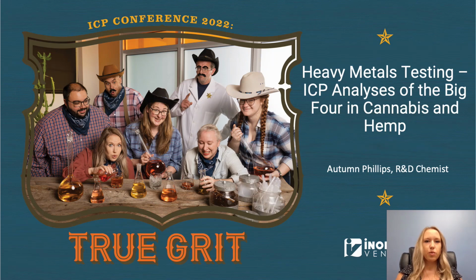Hello everyone, and thank you for joining us. In this presentation, we'll be going through a heavy metals analysis using ICP for cannabis or hemp testing. So the big four are arsenic, cadmium, lead, and mercury.